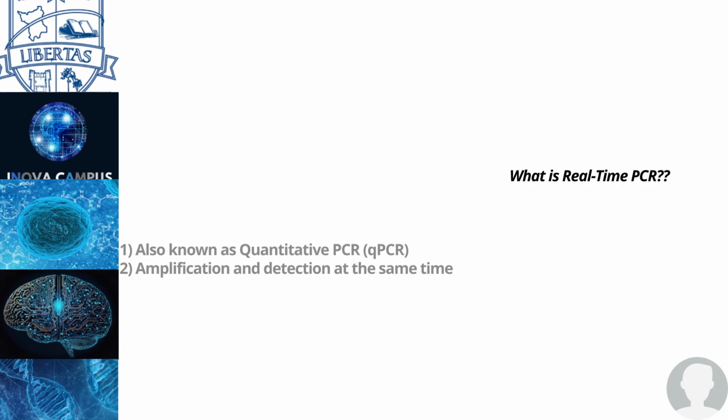And by the way, I'm talking about pathogen material that is used in the medical field a lot. It allows the two things, the amplification and the detection of the fragments, to happen at the same time. And it also provides a greater precision of the quantitation.